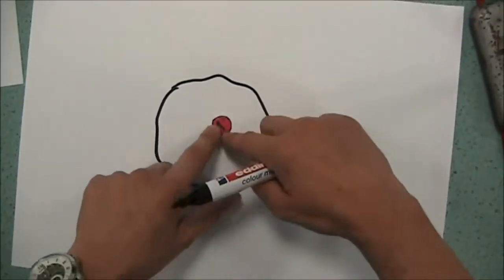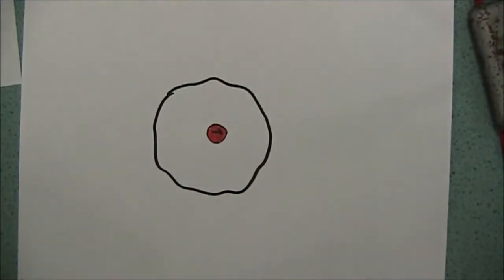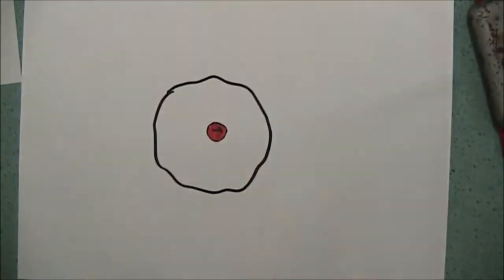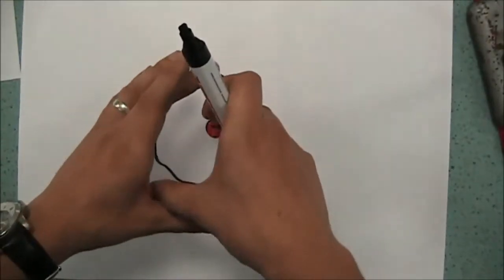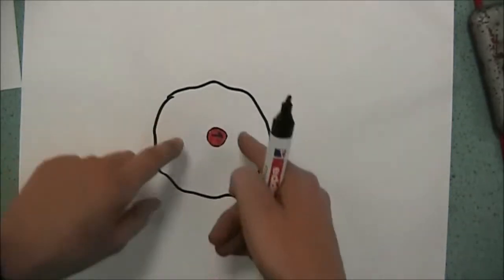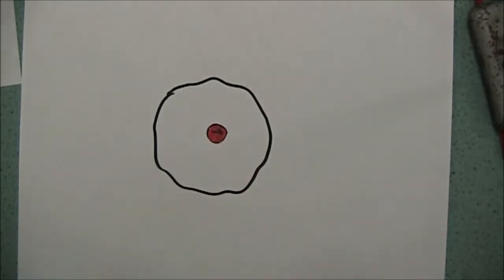So it's not going to turn around to align with the field with so much energy. And so if I have something really electron dense here, we get less of a gap and therefore a lower frequency of radiation given out. And if I have an electron deficient atom, where the electrons are being pulled away by electronegative atoms or something like that, then we'll end up with a really high difference in energy when we oscillate the nucleus, and that means that we're going to get a higher frequency.